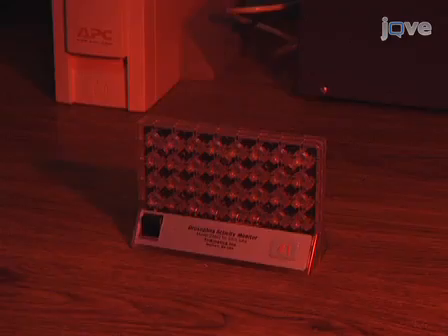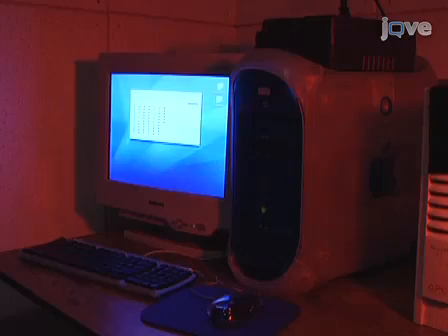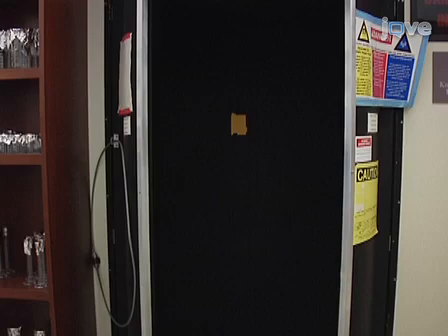The locomotor activity monitoring system involves numerous pieces of equipment, such as specialty monitoring devices, environmental incubators that have the capacity for diurnal light control, data collection devices, computers, and peripheral materials such as wiring. Choose a well-ventilated, temperature-controlled dark room to house the locomotor activity monitoring system to avoid excessive burden on the incubators and their possible failure to maintain temperature. Seal the room from external light sources.